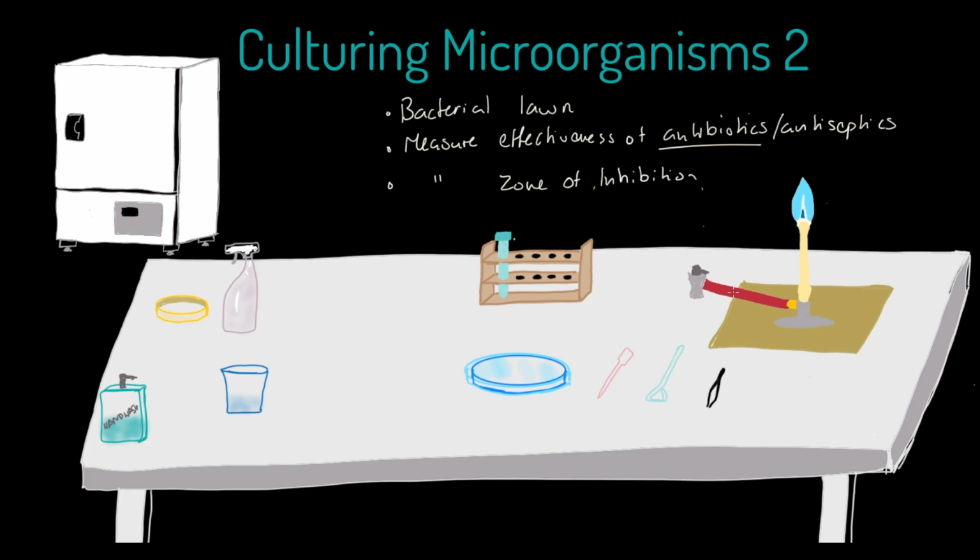Now, I'm not going to be as deliberate as I've been previously in exactly how we set up this experiment and these processes. If you do prepare the bacterial lawn in your school, you're very likely to be following a very specific protocol, so I won't bore you by going through that. What I would say in advance, though, other than the general equipment that we've got available here, is I'll just introduce you to what we call the spreader. It's this little implement here. We've just hand drawn it.